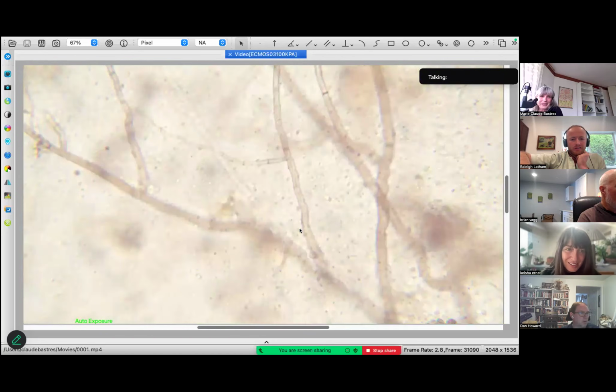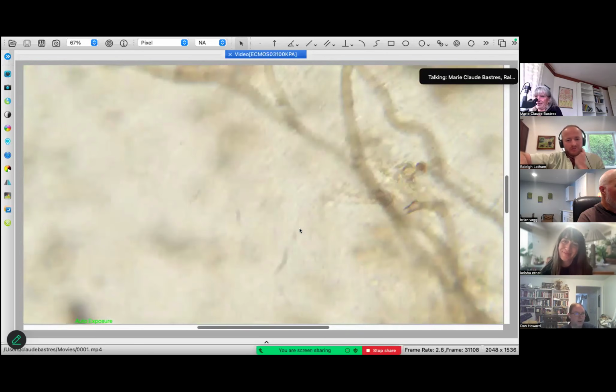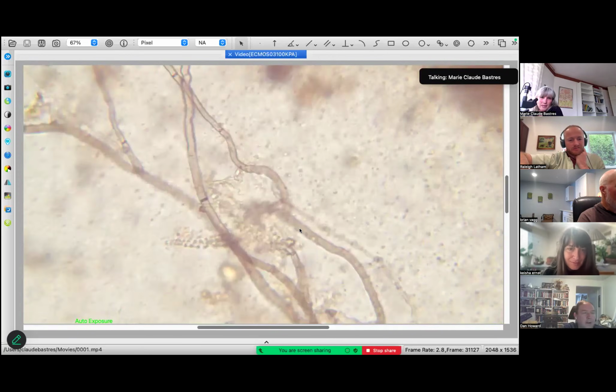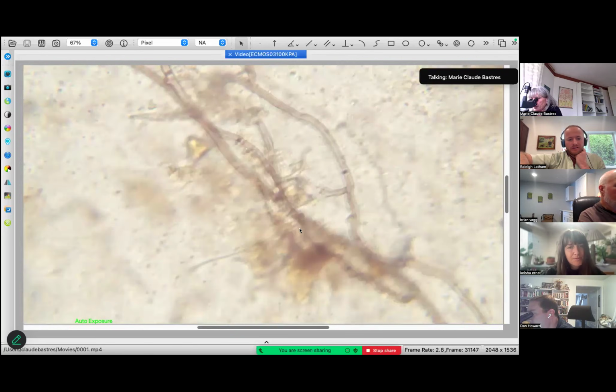Yeah, it's really beautiful. I haven't seen that very often. It's like a fungi tree branch in a sample. Yes, that's really beautiful and rare to see. It has been sitting there for a long time, nobody touching it. I mean, 6 months not touching. It has some clamps there. No, it's no clamps.